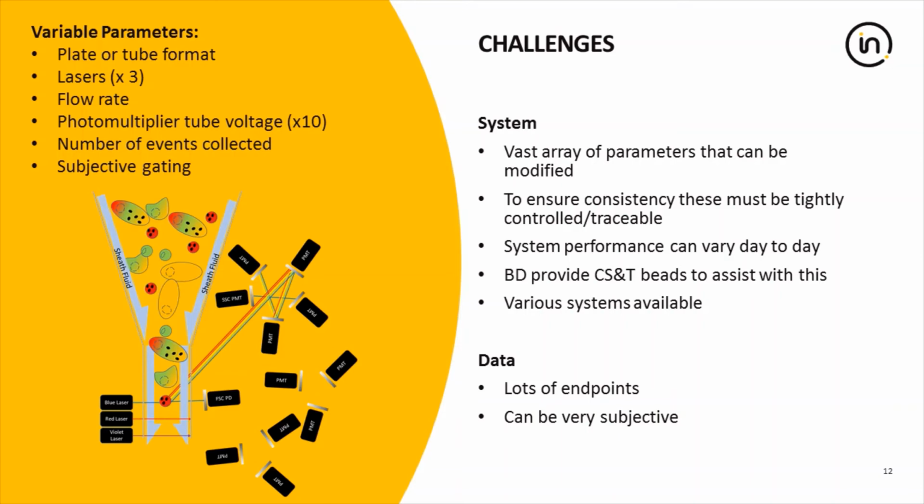Another area that presents a challenge is the data analysis. Different interpretations of flow cytometry plots by different individuals, or even the same individual on a different day, can drastically alter results. For this reason, it's crucial to have a defined gating strategy in your method that is as objective as possible.